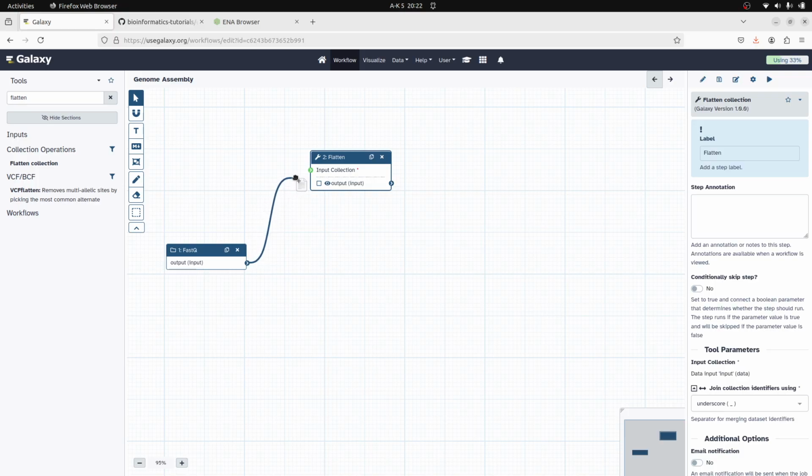So drag and send it to the same symbol in the flatten tool, which is here. So send it in there and then release. When you release, this is what you are going to get. Okay, wonderful. So that means this is our input. When we have the input, the data will be sent to the flatten tool, which is very good.